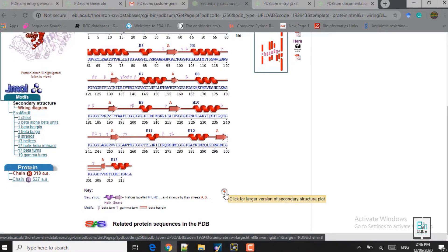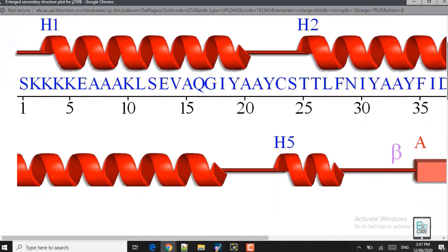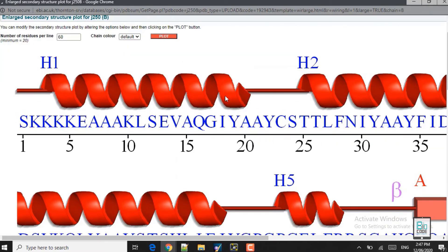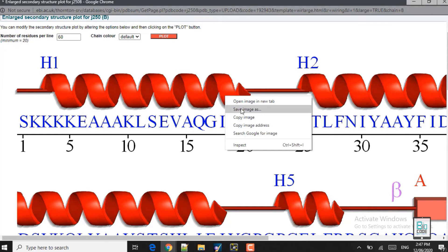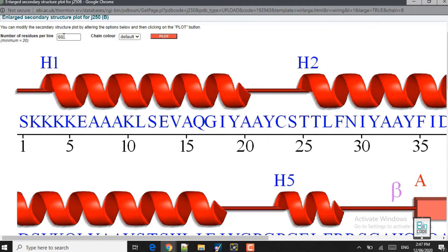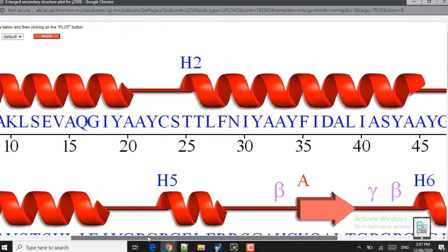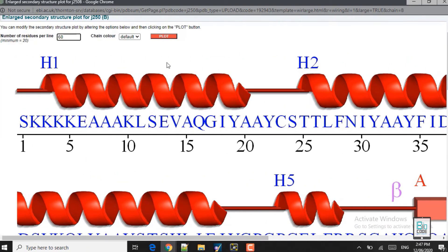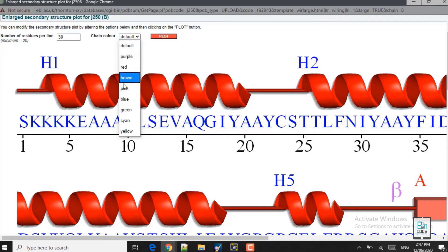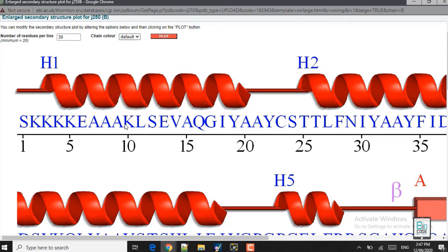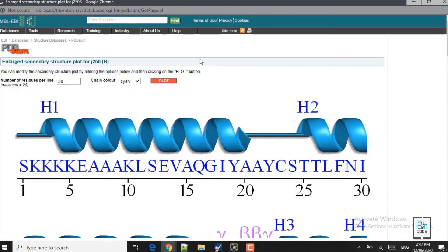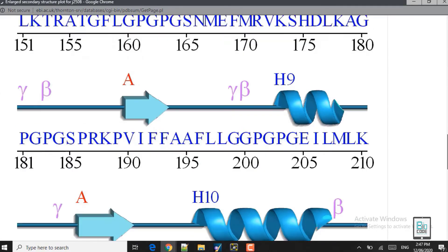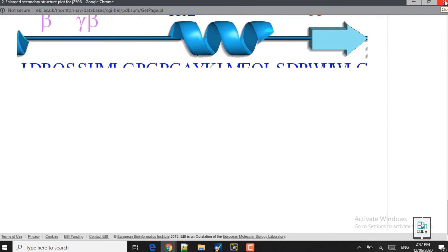If you click on the magnifying glass it will provide the secondary structure in more detail. The structure is revealed at higher quality — you can save this image for use in manuscripts. In each line it will show 60 amino acids by default in red, but if you want to see 30 amino acids in each line and change the color to purple, red, brown, or cyan, you can choose that as well. I will click on cyan and then click on plot — now you can see 30 residues per line with the color changed to cyan.